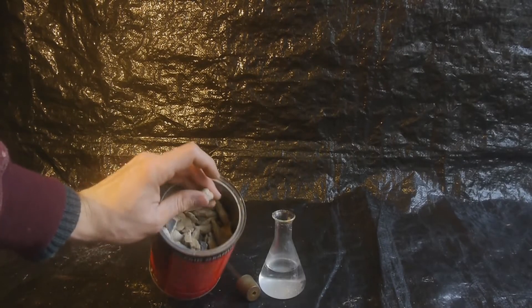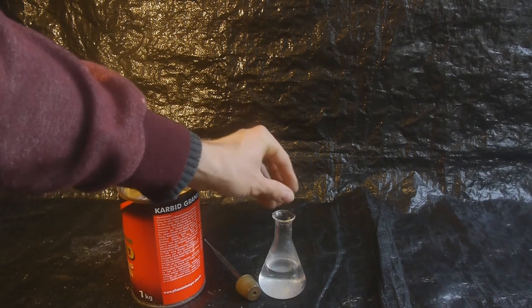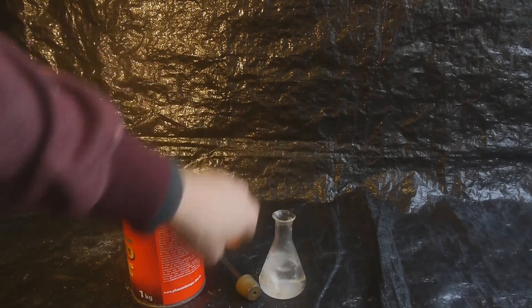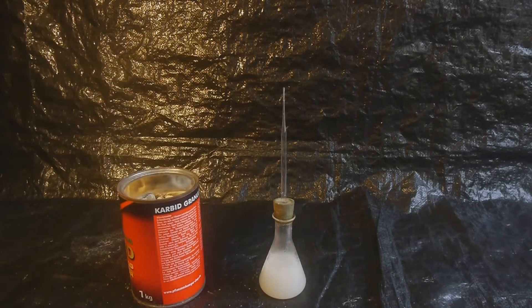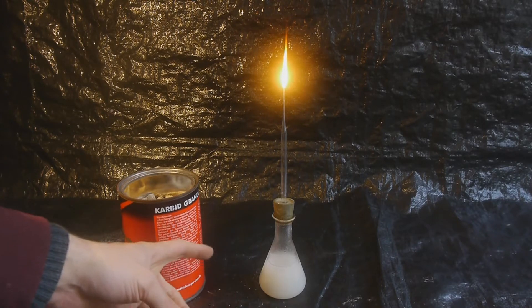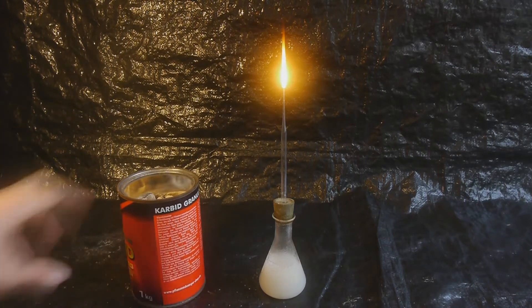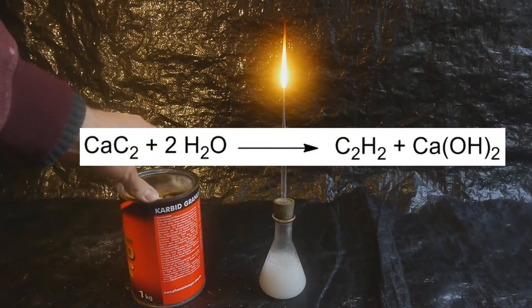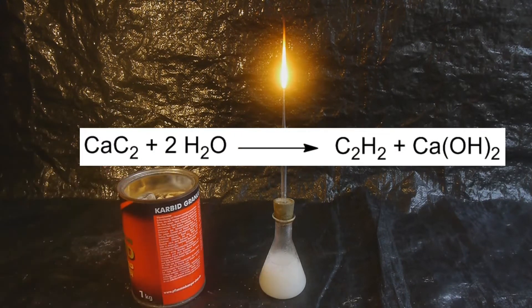Here I have some calcium carbide with the chemical formula CaC₂. If I drop it into water you can see that it reacts rather vigorously while forming a gas. If we light that gas on fire you can see it burns with a very bright and beautiful flame. The gas we are forming is known as acetylene or ethyne, with the formula C₂H₂. That means the calcium atom is getting replaced by two hydrogen atoms, and at the same time we are forming some calcium hydroxide.